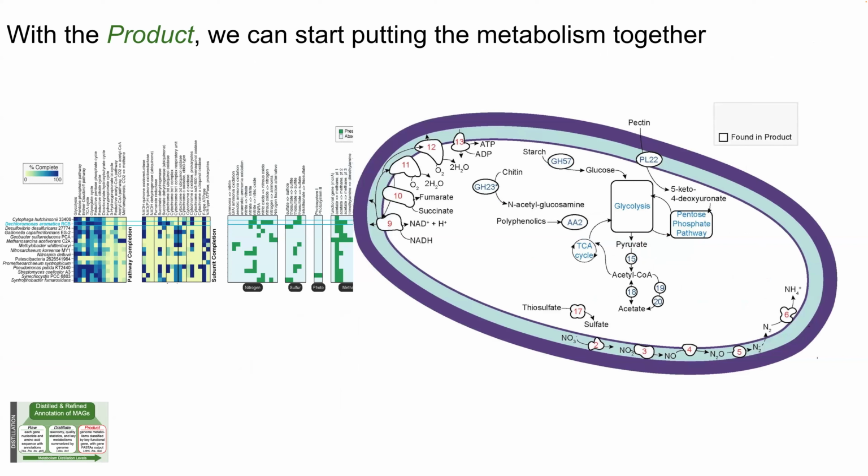Are there any questions before we summarize all the enzymes or anything? Really, I think the CAZymes are the perfect example of how DRAM is different from, like, Prokka, for example. That was a lot of manual curation, and also we required the oligo and the backbone because a lot of those CAZymes are promiscuous, so they act on multiple different substrates.